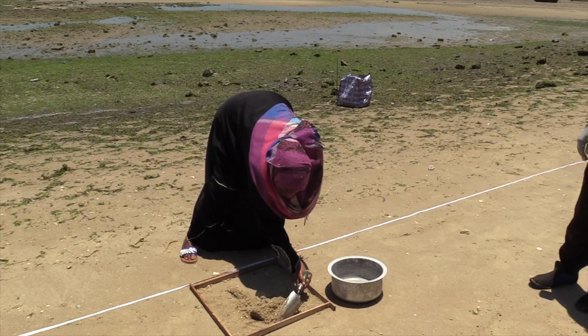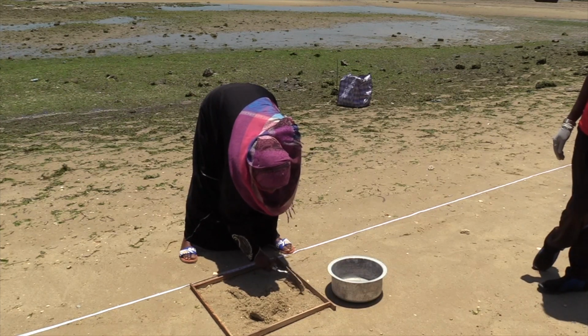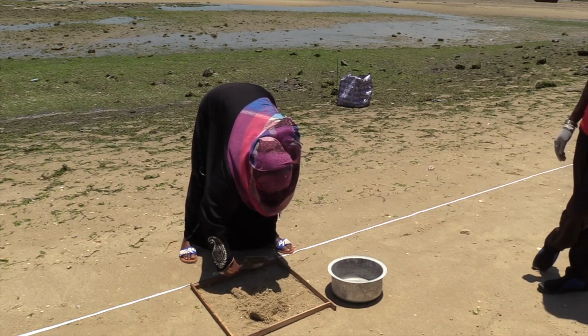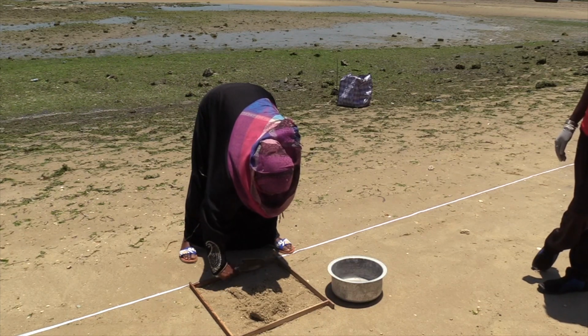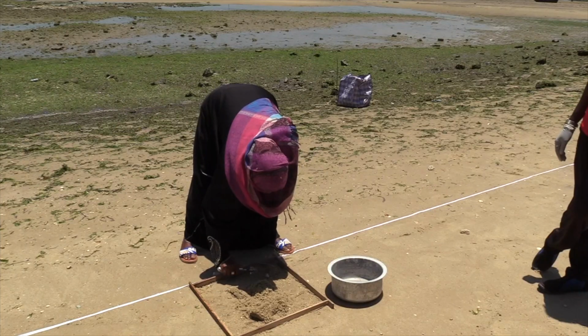We use 2 centimeters because it is the area where we can find organic material, such as living organisms, and also the microplastic that is stuck in that area and not deep in the land. All those 5 replicates from the quadrant, we take each independently.